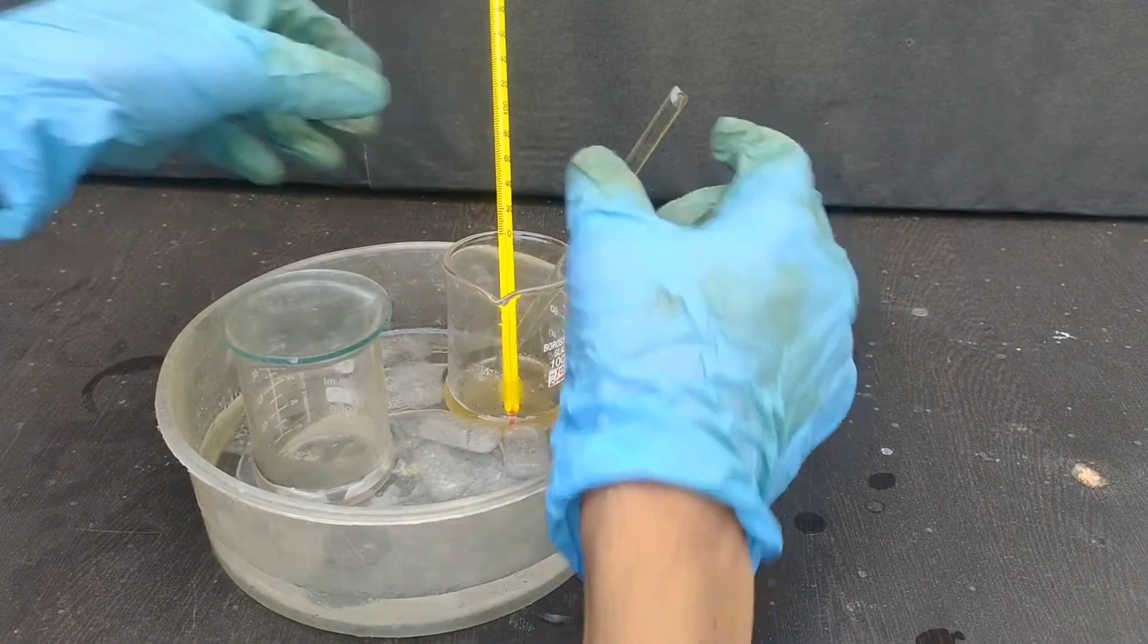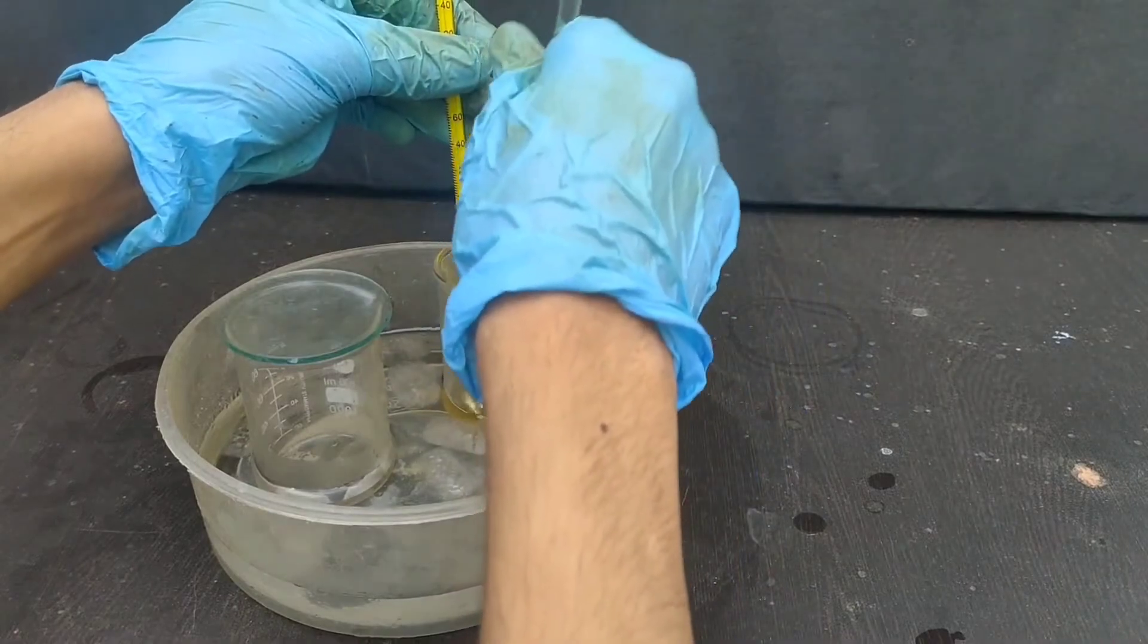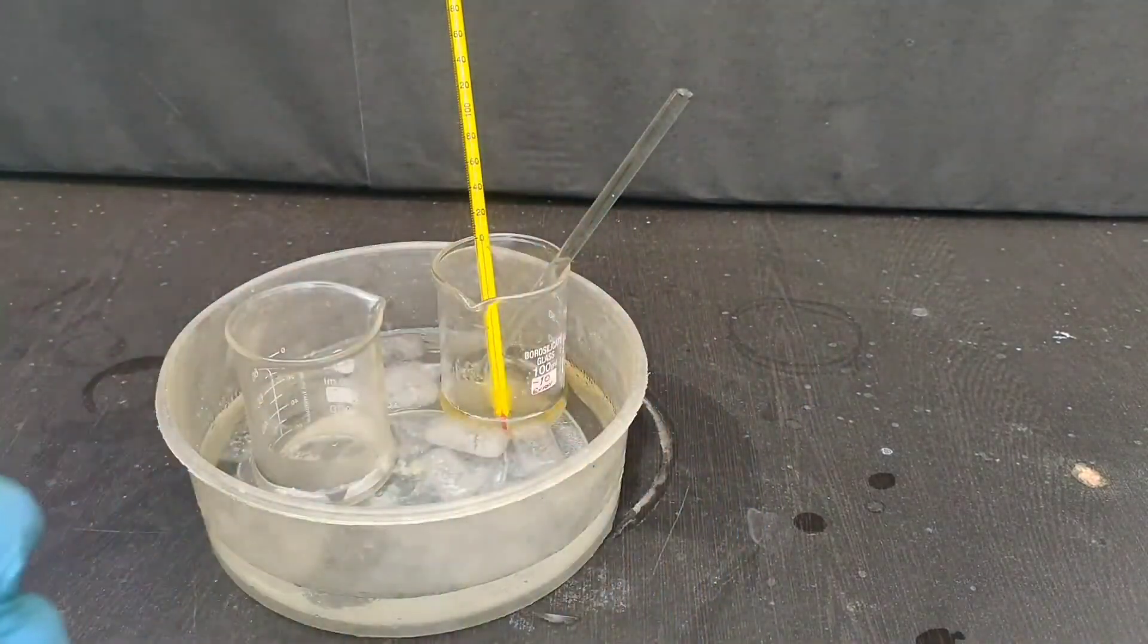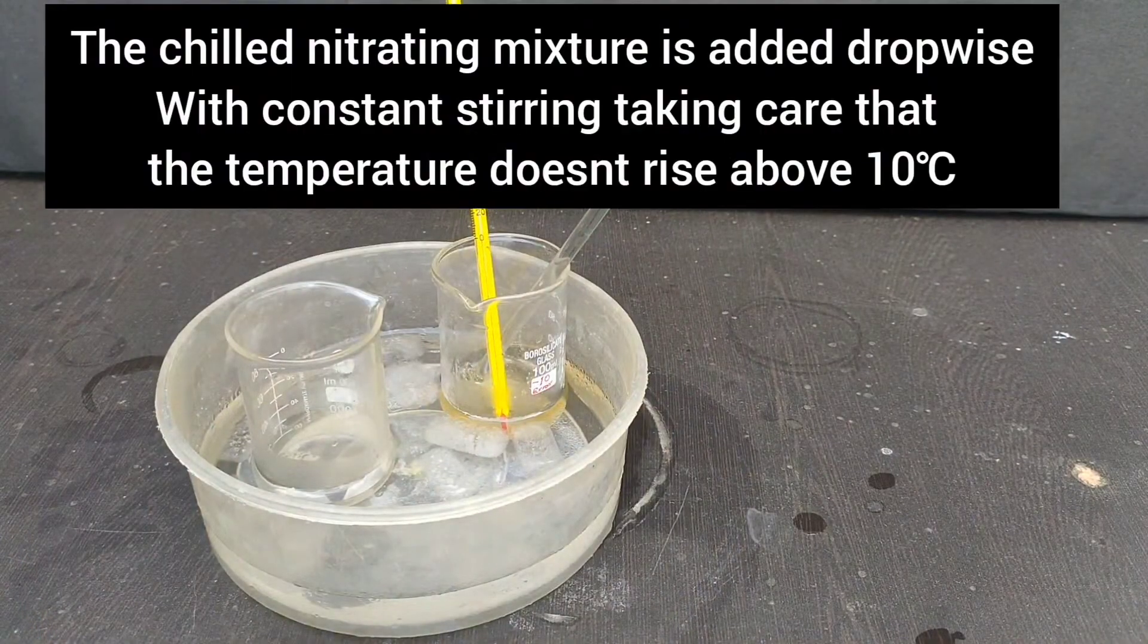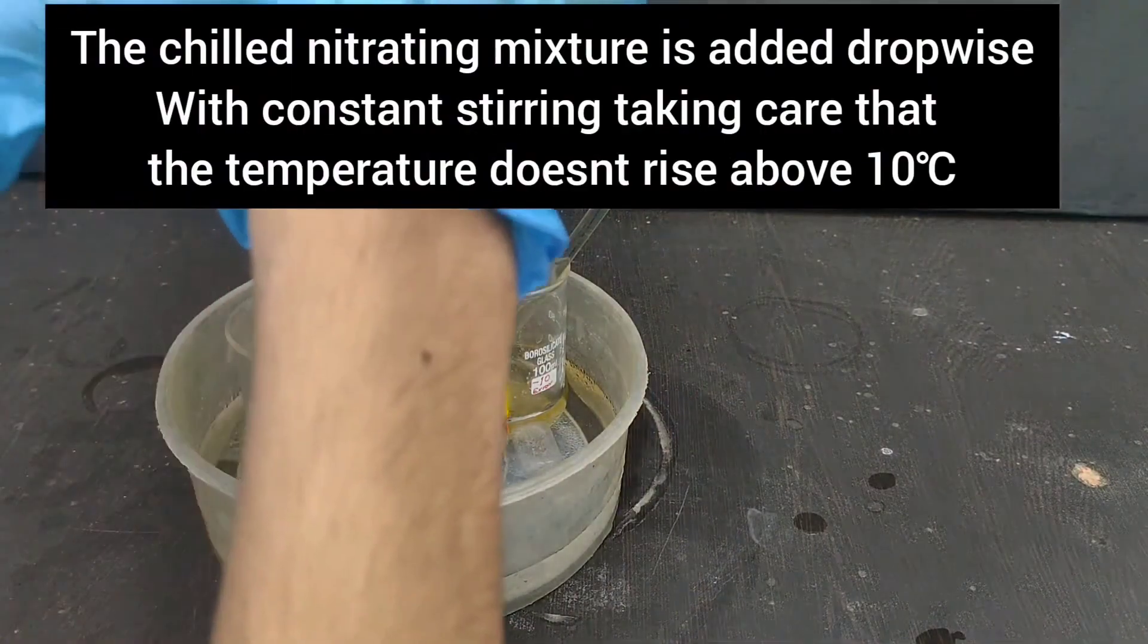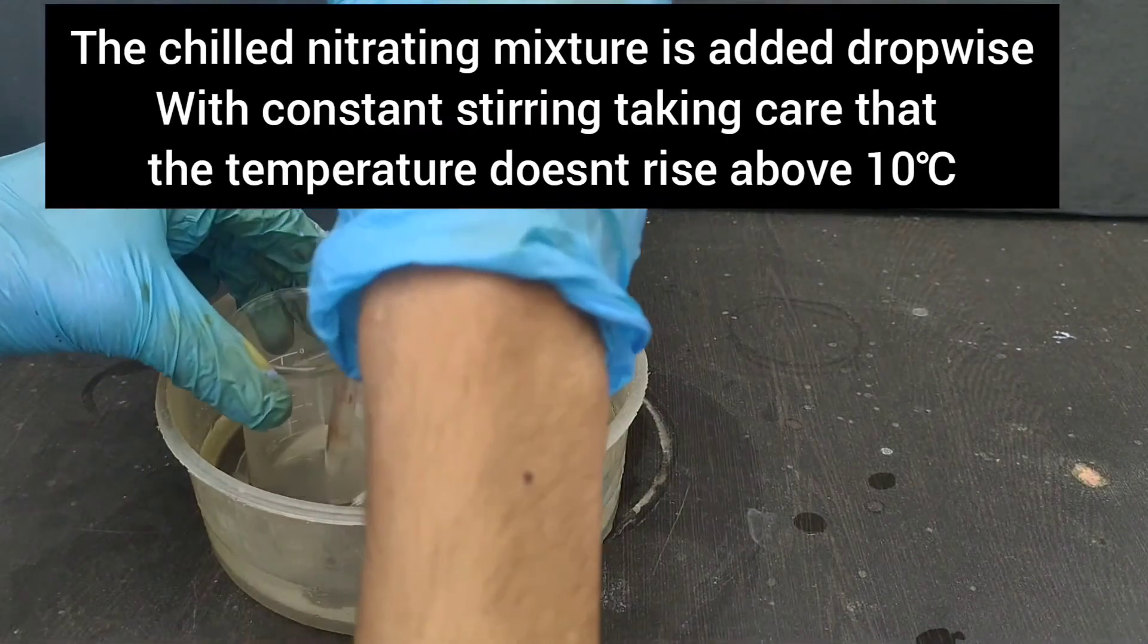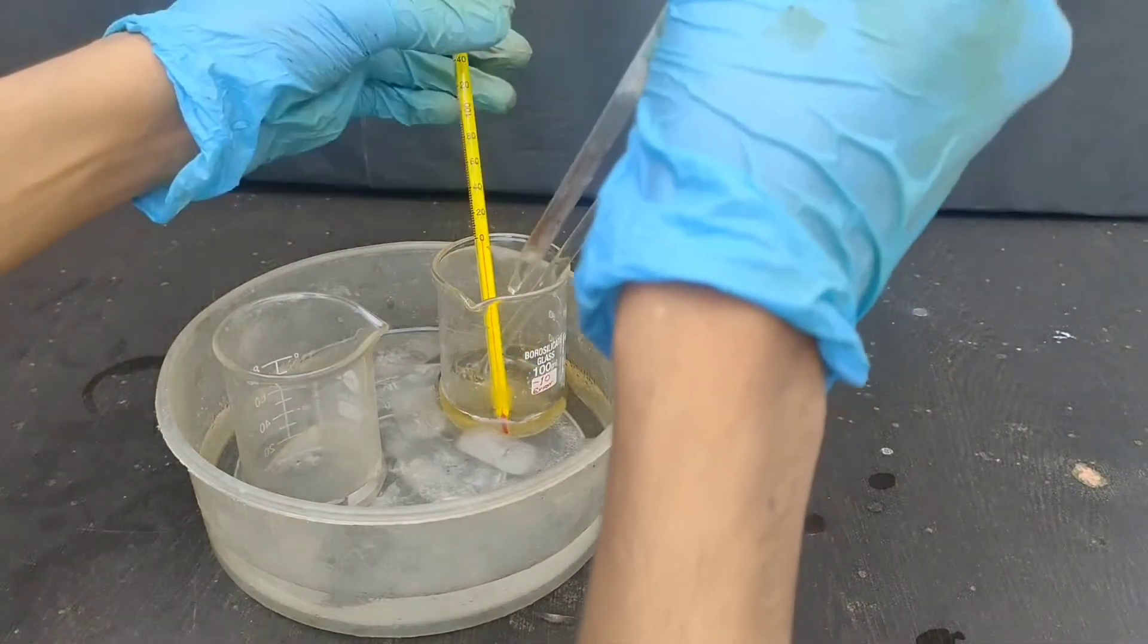After chilling the mixture up to 0 degrees Celsius, the nitrating mixture was added drop-wise with constant stirring, taking care that on each addition, the temperature does not rise higher than 10 degrees Celsius.